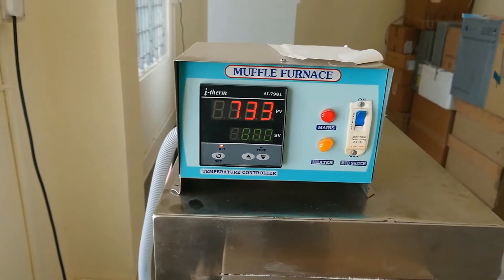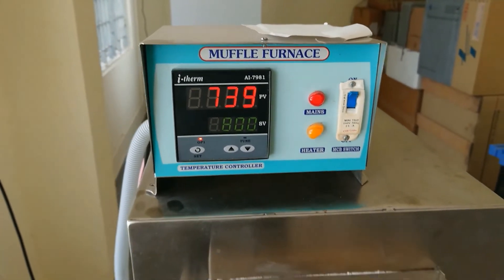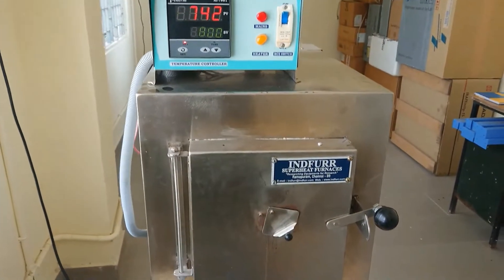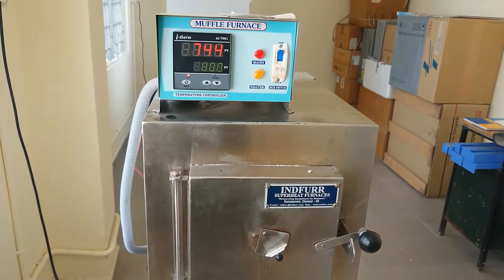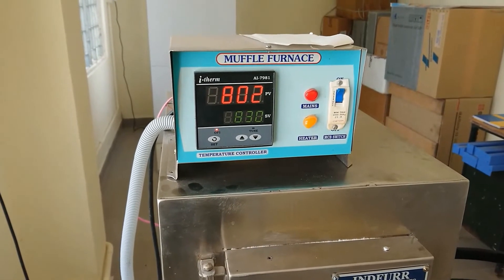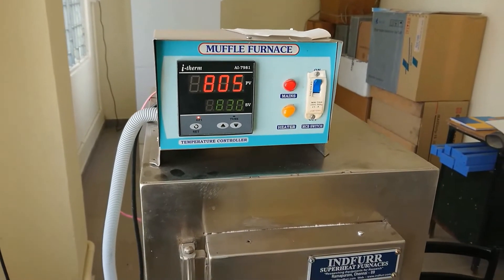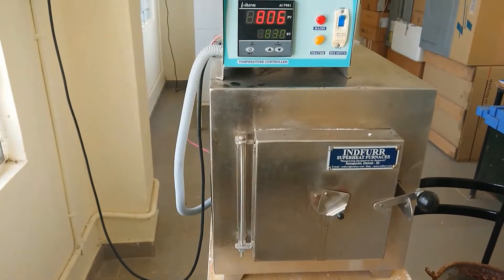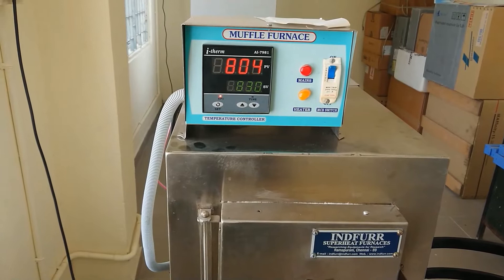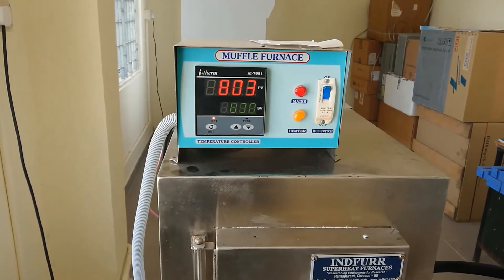Now we have to wait for the temperature to reach 800 degrees Celsius. Once the temperature reaches 800 degrees Celsius, check the time and wait for 15 minutes. Keep the workpiece for 15 minutes at that temperature.